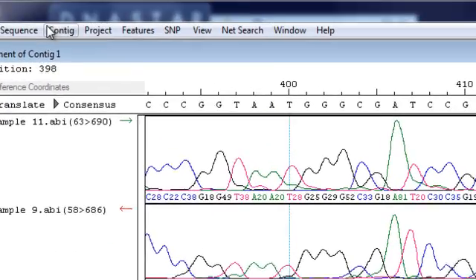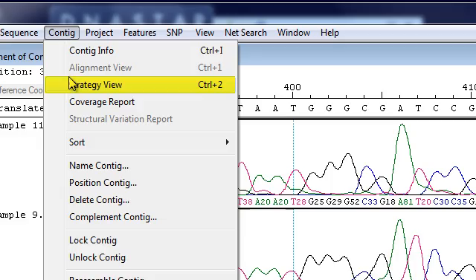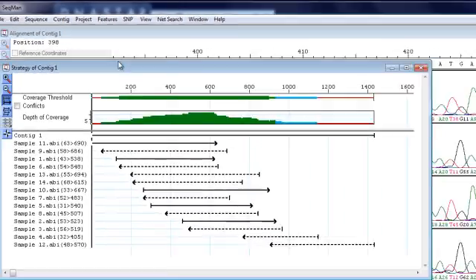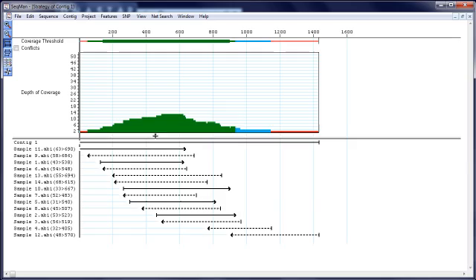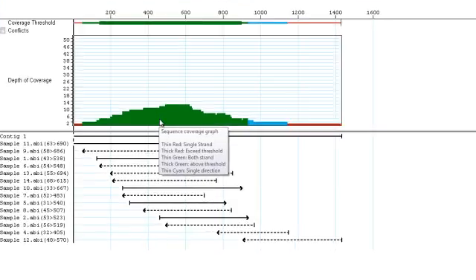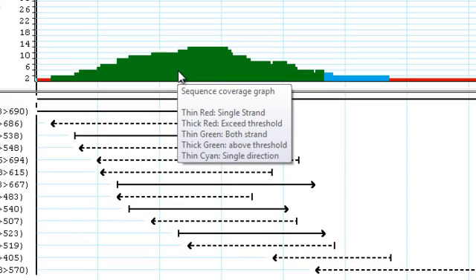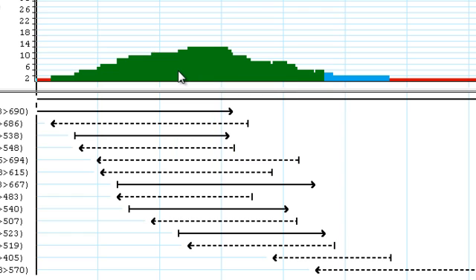Use the strategy view to see a graphical representation of coverage along the assembly. The histogram in this view is color coded based on depth of assembly and sequence directionality.